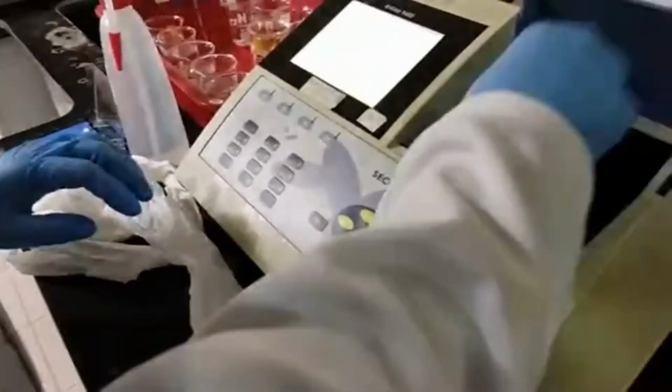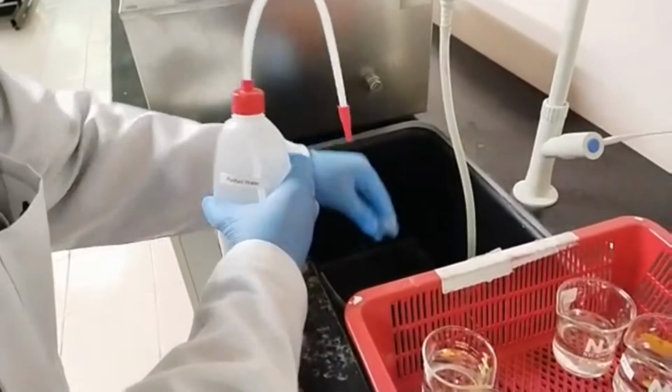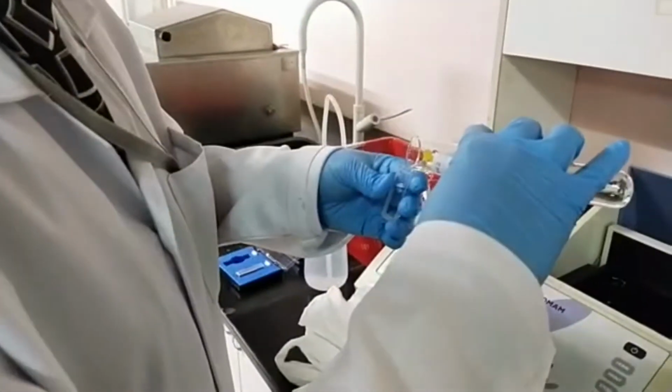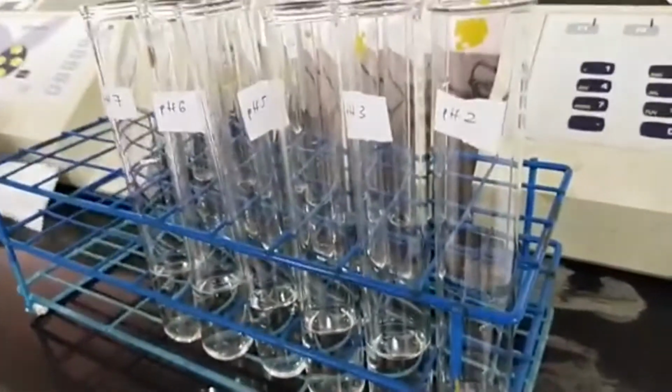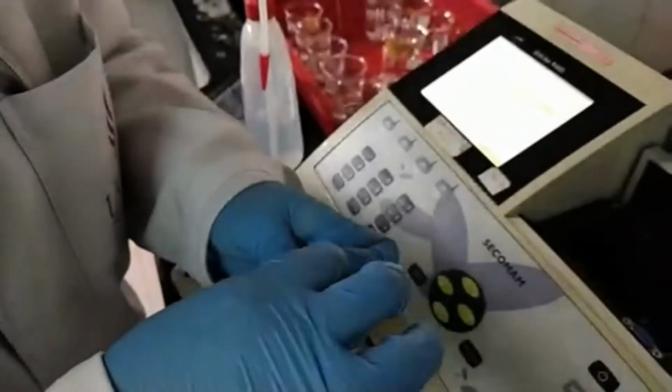Okay, then this one will be washed and replaced with a mixture of furosemide, also pH 2. Quartz cuvette needs to be wiped before putting in.